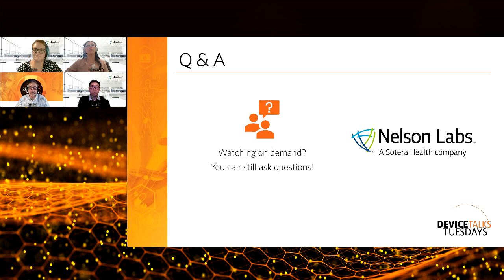So I would say if you have a gel, you really want to have a well-documented biological evaluation plan that talks about your rationale for how you're going to sample that product in all of the different tests. It's not just one and done, because all the tests have different considerations, different animals that we have to be considerate of. So if you have a gel product and you don't have a very nicely written BEP, please email us, because we would love to help you with that, because that takes a lot of coordination with the lab. Yeah, it really does.